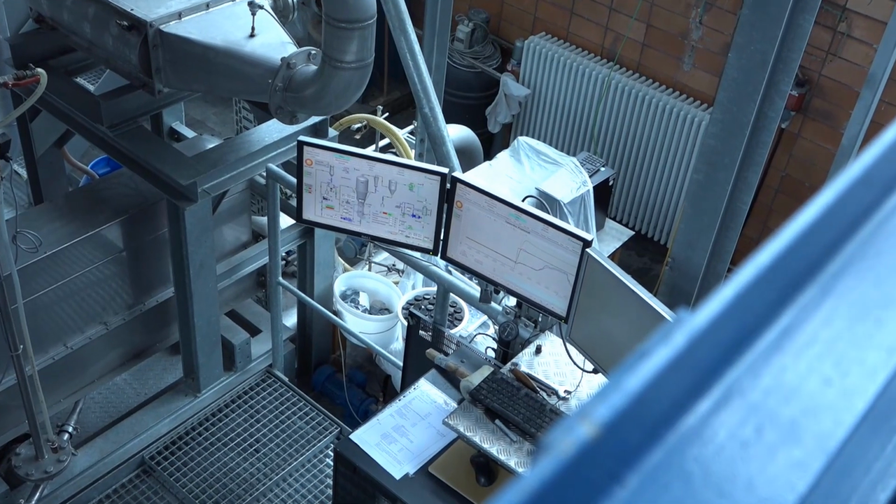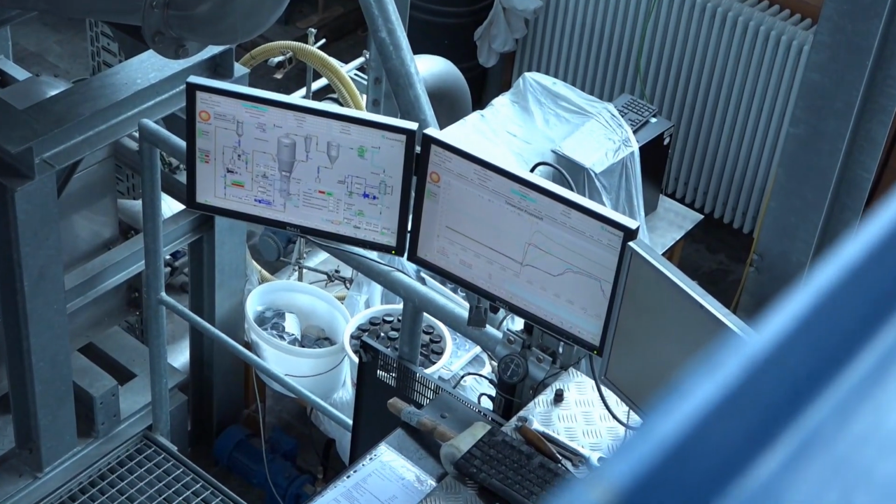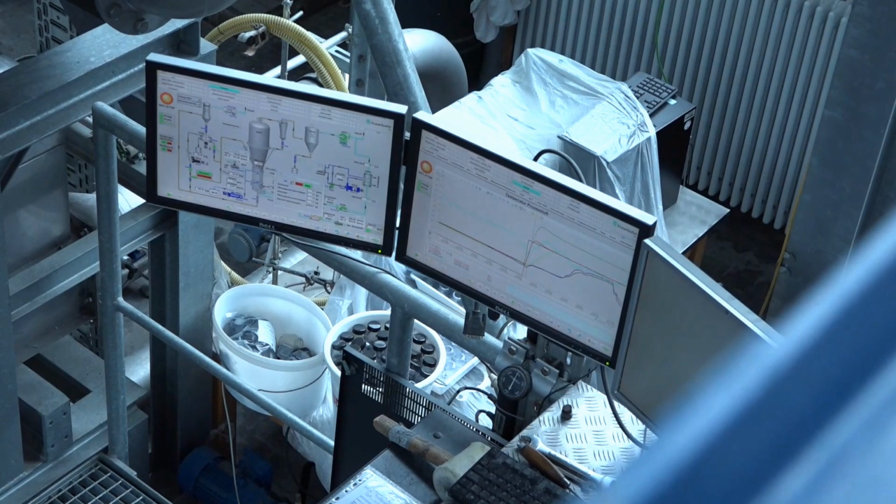And maybe we just have a short look at the temperature curves of the process. We can see inlet conditions are continuously stable, and the temperature increases during the drying process, and then after some minutes we start the charge of wetted material, and then the bed temperature and outlet temperature decrease in the process. This can be observed quite easily from the temperatures.